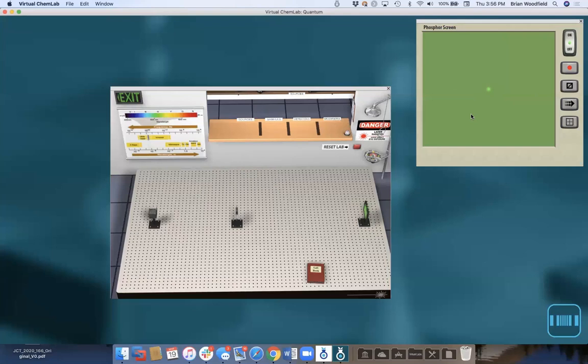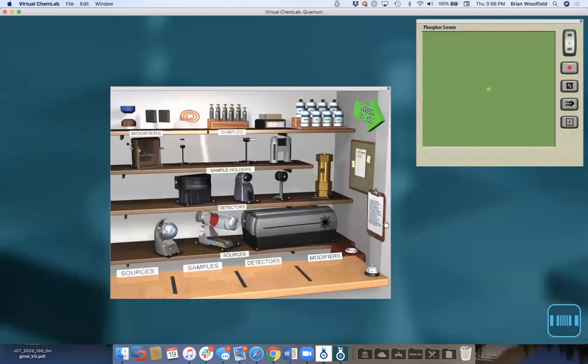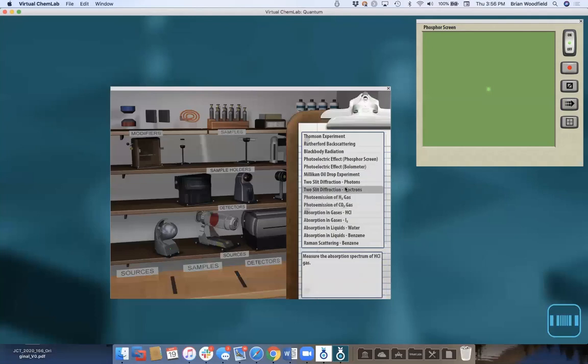Now we can ask them why, what's going on here? You know, why did Rutherford choose gold? And what would have happened if he would have chosen magnesium or something like that? And so we allow them to do all of these experiments. And so, in the interest of time, we're almost out of time already, but you can do lots of things here.